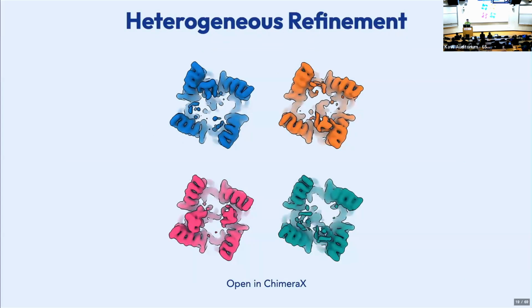And I think there are a few reasons for this. One is that we didn't really provide any indication of what we were looking for, right? And that's personifying the algorithm a bit. But we didn't say this one should have a calmodulin here, this one there, this one there, this one there. We just gave it four and said, find the difference. And so some of these, it's only got two. Some it's got two in a different position. The one on the top right, it's mostly only got one. So there is, in some sense, it's working that way.